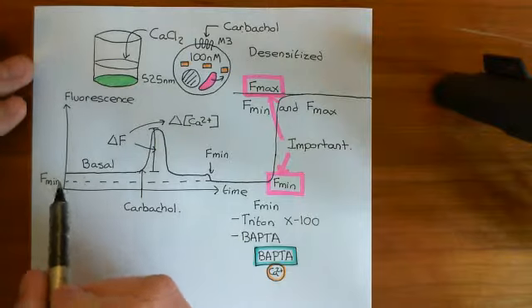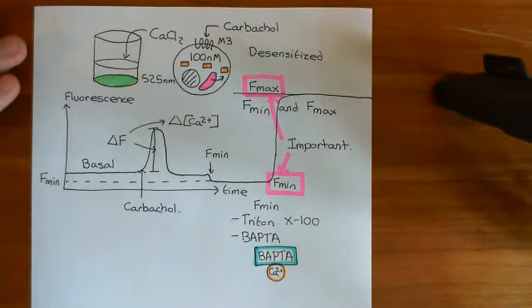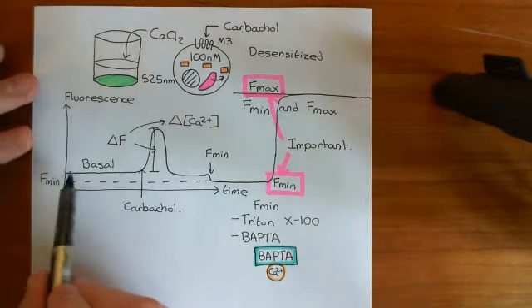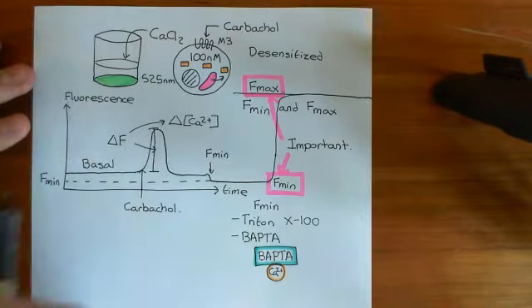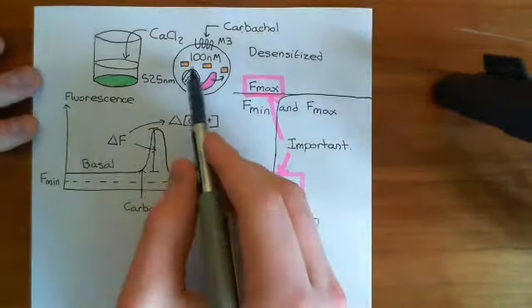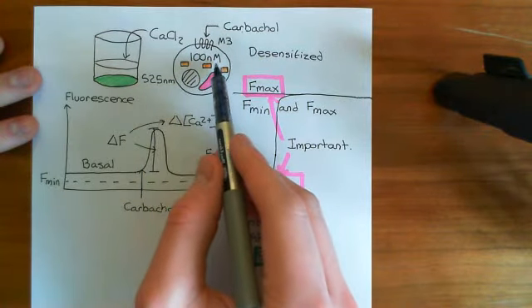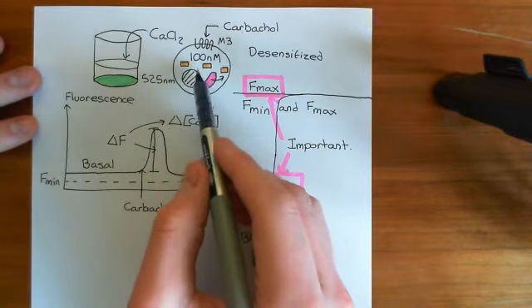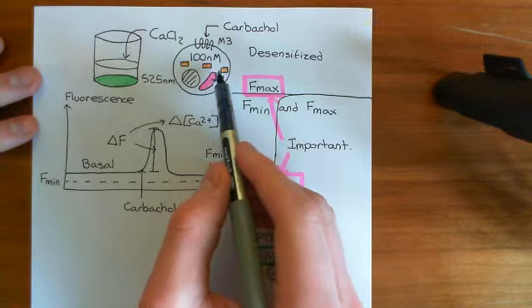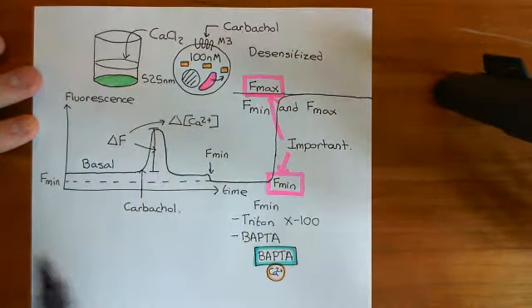Then what we do is we stimulate the Fluo-4 molecules with blue light, and we get green light coming back again, and we get this basal level of fluorescence coming from our cell monolayer, which results from some of the Fluo-4 molecules being bound to calcium, because you do have 100 nanomolar calcium concentration in the cytoplasm usually, and also the ones which are not bound to calcium at 100 nanomolar will still have some fluorescent properties.